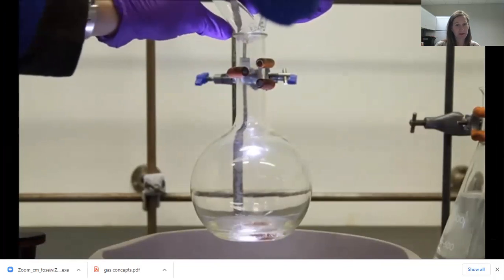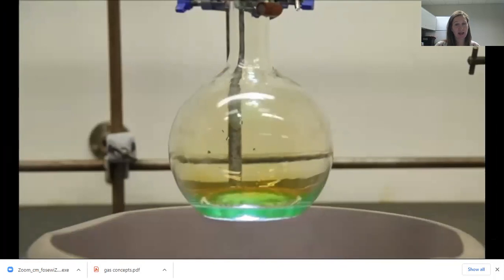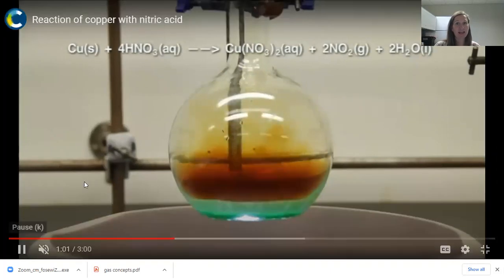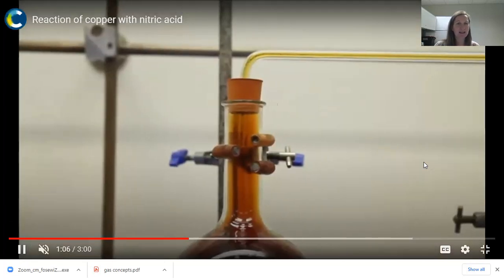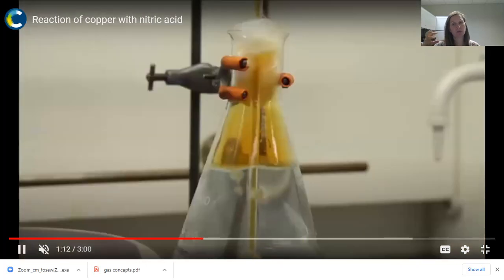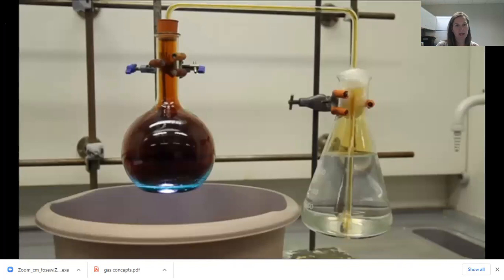So you're going to see an immediate reaction. Notice immediately the solution itself, that clear colorless nitric acid, starts turning a greenish blue color, and you immediately see this brown gas starting to form. And you can see they have the equation written right up here. It's balanced, and it even has the states of everything. So if you want to go back and look at that. Now in our lab, we normally do this in the hood so that that poisonous brown gas, that nitrogen dioxide gas, is fumigated through the hood. They're actually doing it through a bubbler to try to make it a little bit more safe.